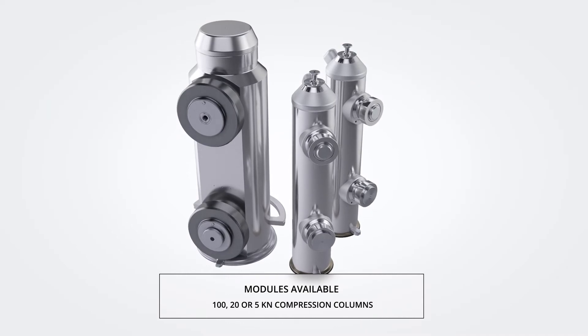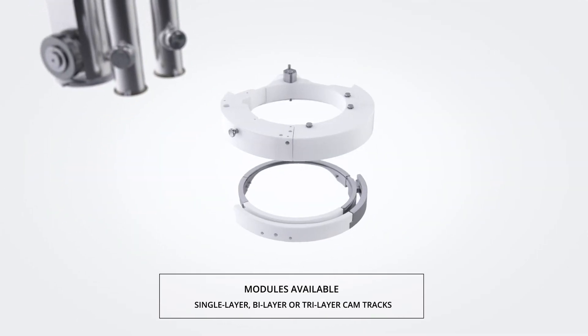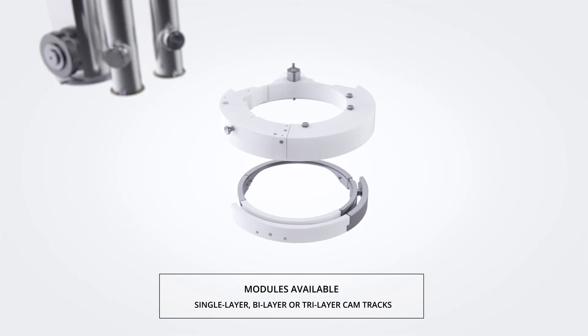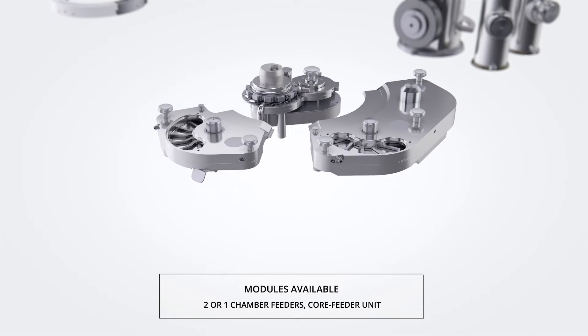The variety of modules permits building eight different single and multi-layer machine configurations while adapting the process to different material issues like marginal flow properties or challenging compressibility.